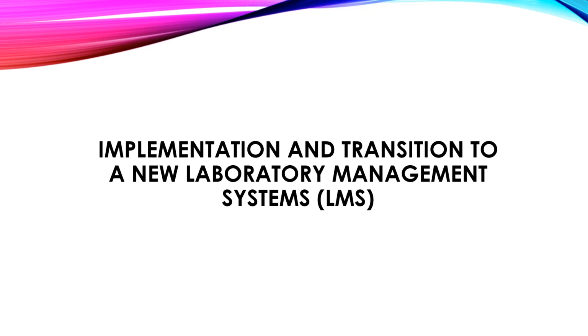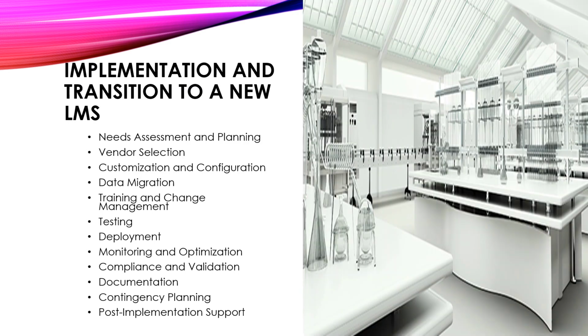Implementation and transition to a new laboratory management system. Implementing and transitioning to a new laboratory management system requires careful planning, coordination, and execution to ensure minimal disruption to operations and maximum benefit realization. The following are the various steps to help you navigate this process effectively.